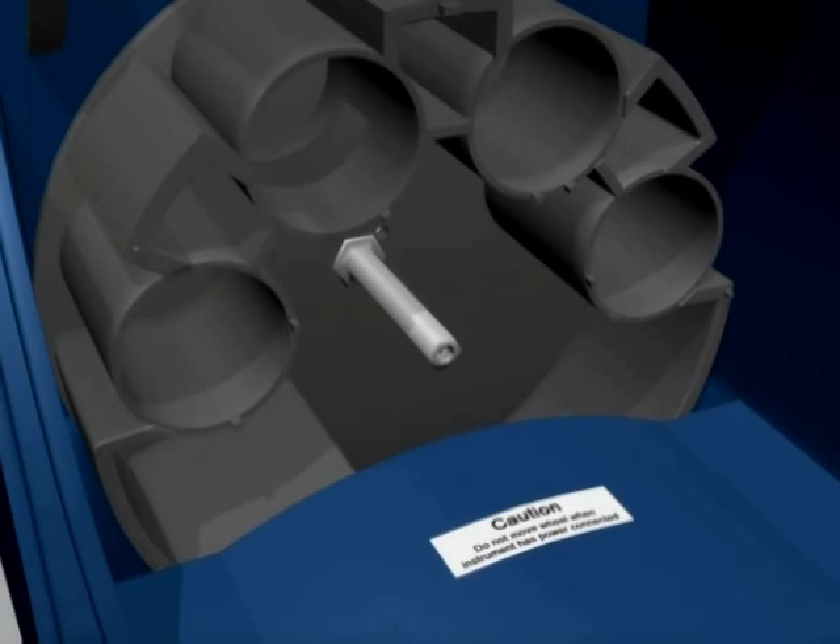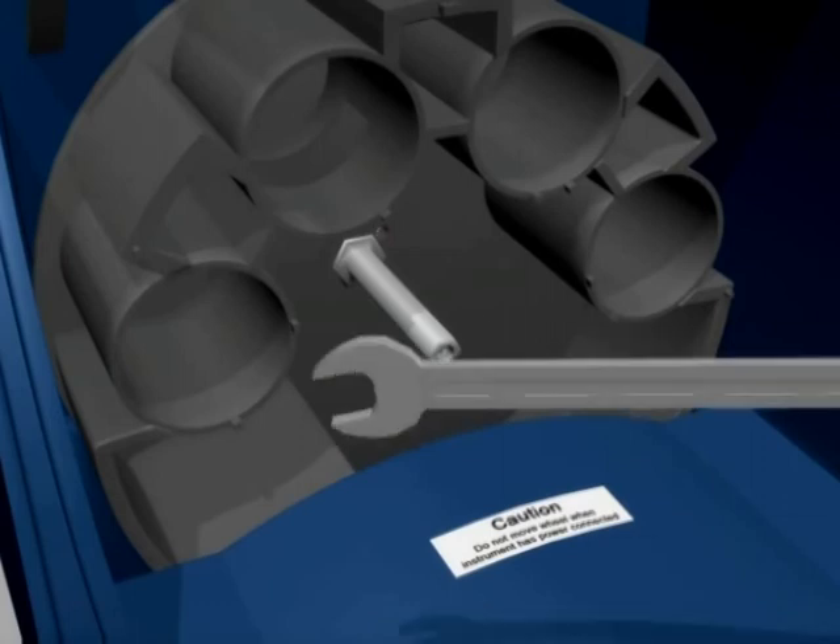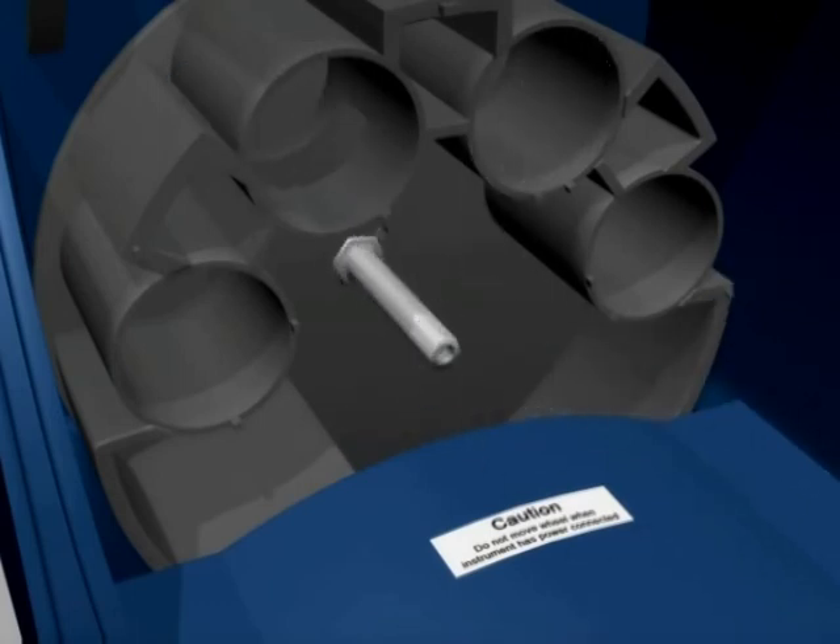When remounting the sample handling wheel, the location pin must be threaded through the corresponding hole in the back cover of the wheel, to avoid any damage to the motor components. Hand fit the long bolt and then tighten to finger tight with the ring spanner.